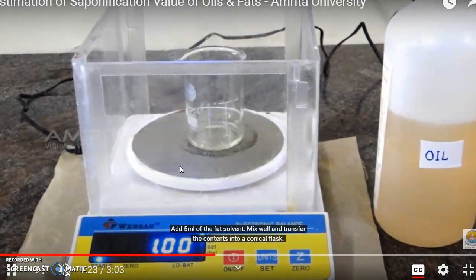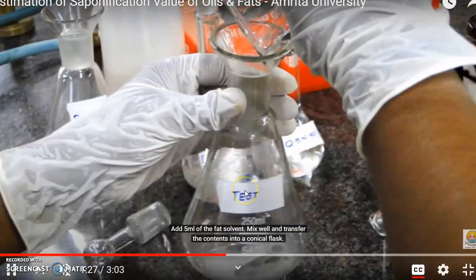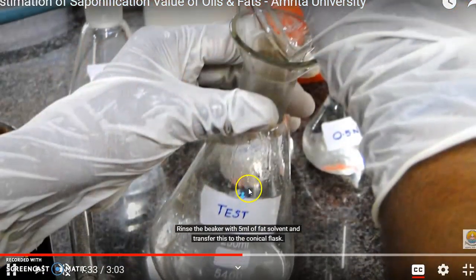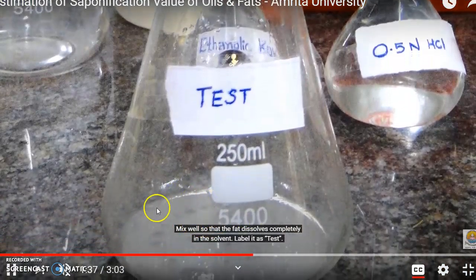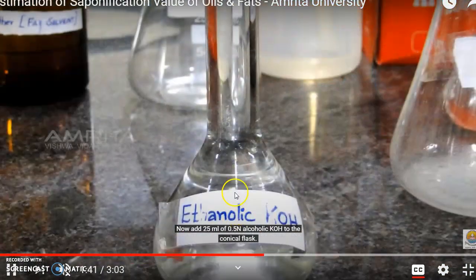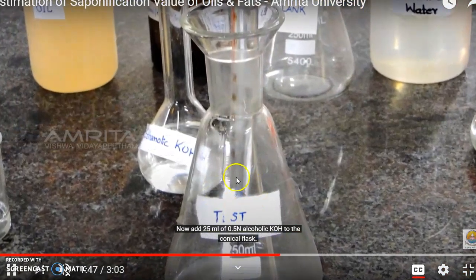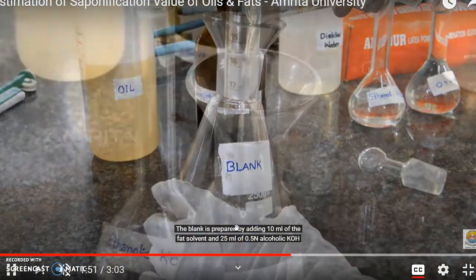After weighing the actual quantity, you take 5 ml of the solvent in which the fat is soluble, such as petroleum ether. Another one is the blank solution, which is labeled as the blank. Then take 25 ml of ethanolic KOH, which you have prepared as 0.5 normal alcoholic KOH. You can prepare that and add this 25 ml in a conical flask.